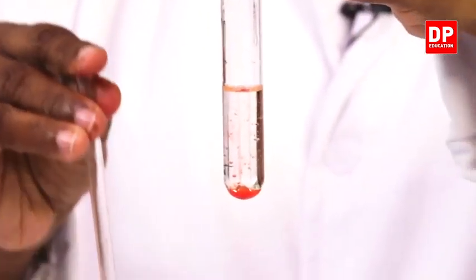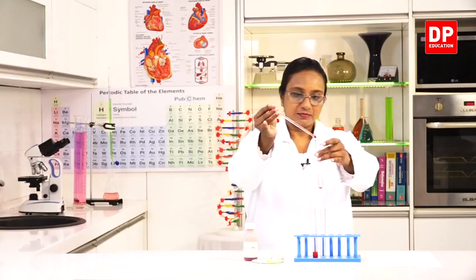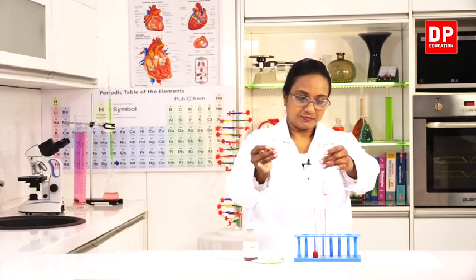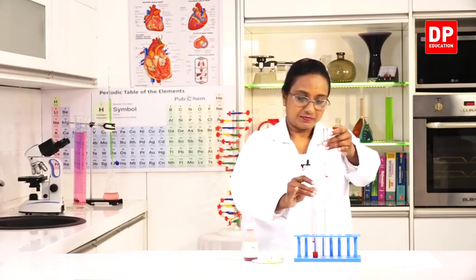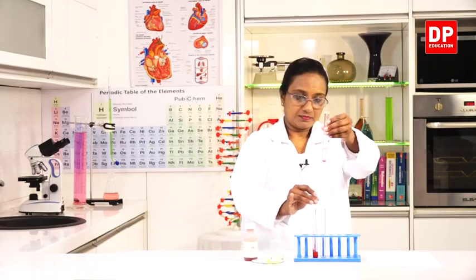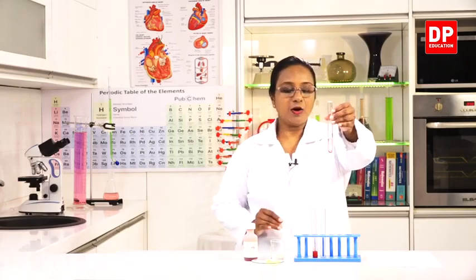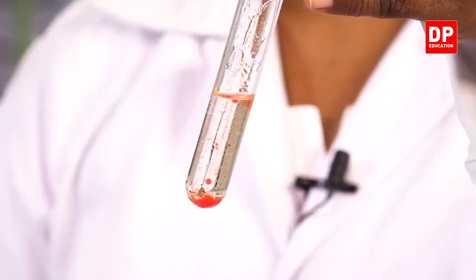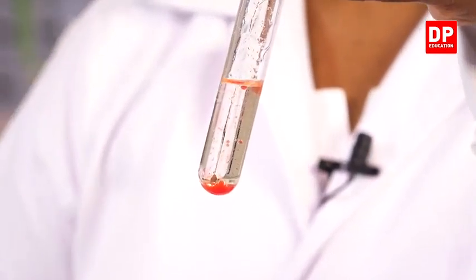I will add one more drop. Here you can clearly observe the red fat globules.